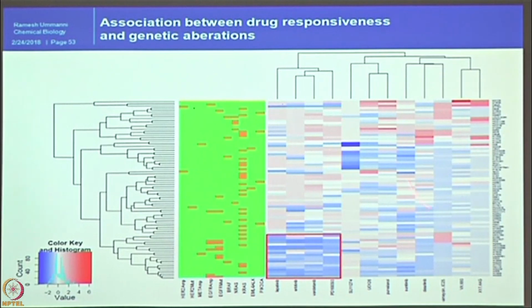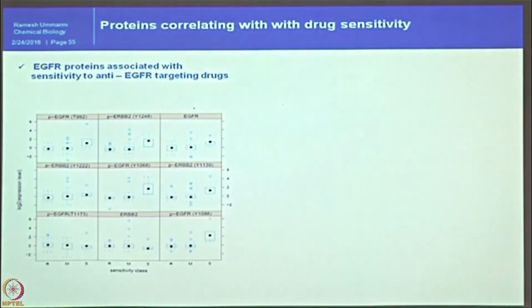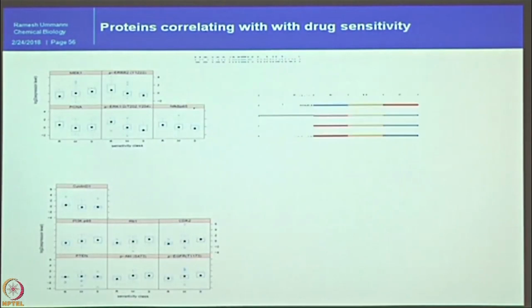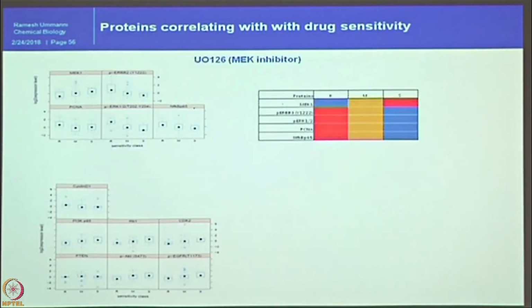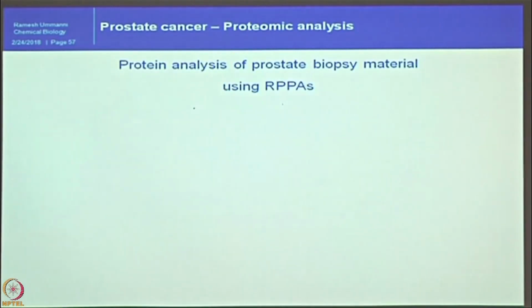Now, can we establish some new prediction markers using the other data set? So using this we also established other data sets. In this case it is nicely aligning here. Further, we established a set of markers for all the drugs we have screened for their IC50 values against 84 different cancer cell lines. So this is a way we have established.